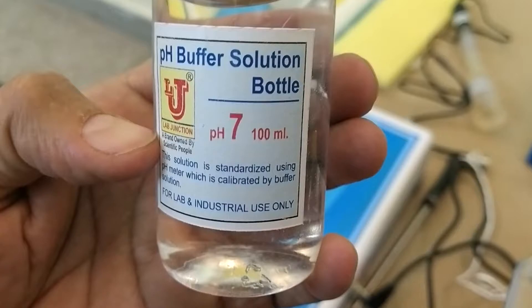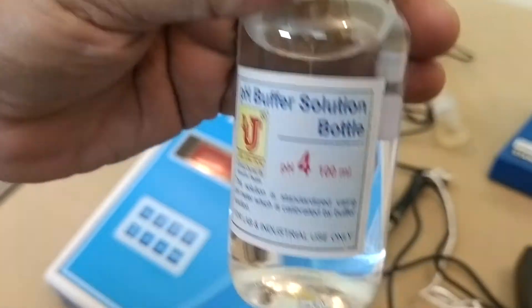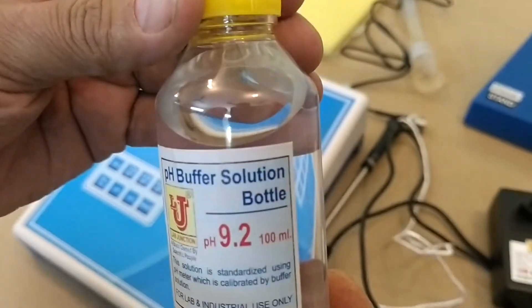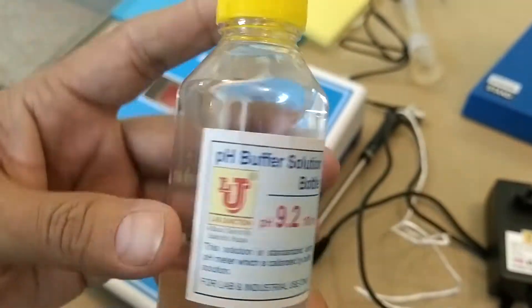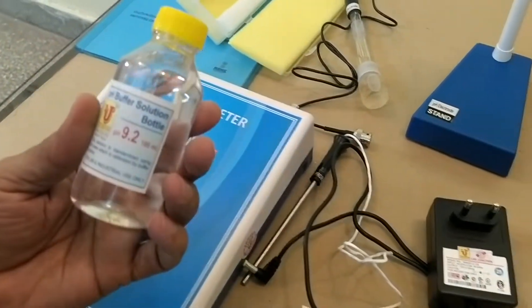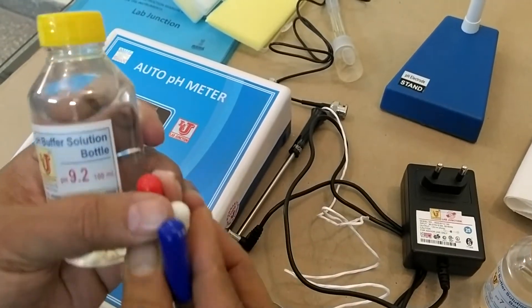This one is 7 pH, this one is 4 pH, and this one is 9.2 pH. How to make these standards from these buffer capsules.